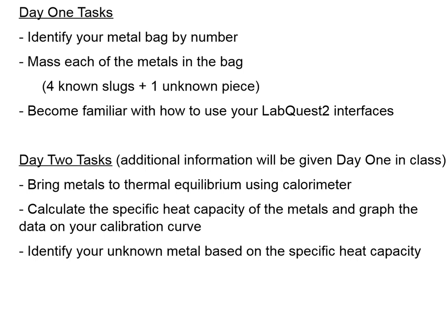day one, you're going to identify your metal bag number. Each one of the bags is going to have the 5 pieces of metal in it, the unknown and the 4 slugs. Okay? You need to mass each metal that's in that bag. And the reason why you want to identify which bag number you have is because you're going to come back the next day for day 2.